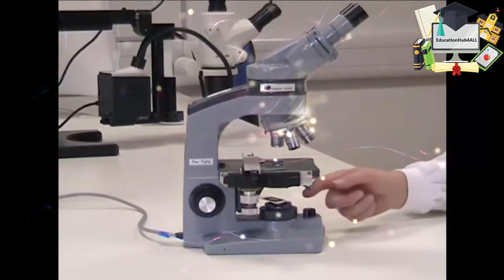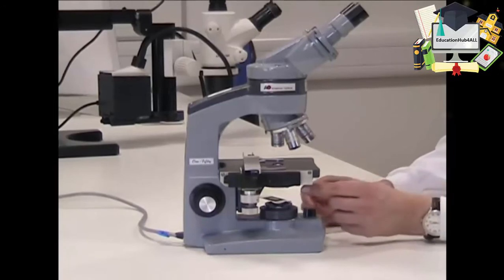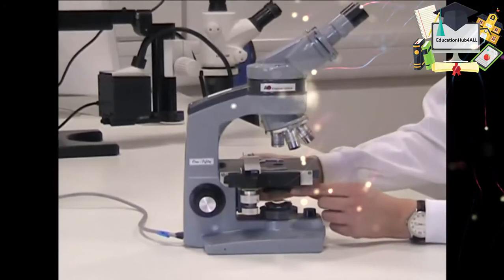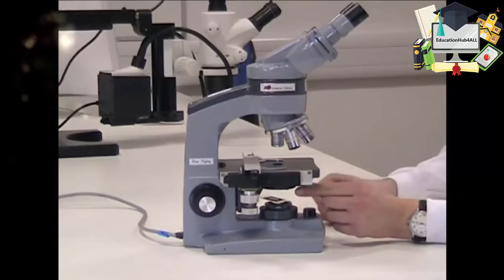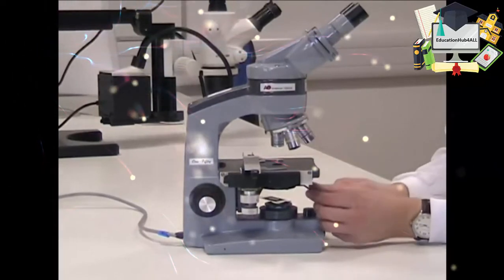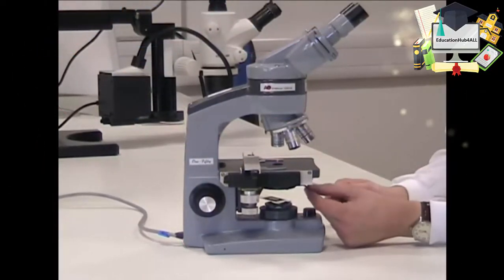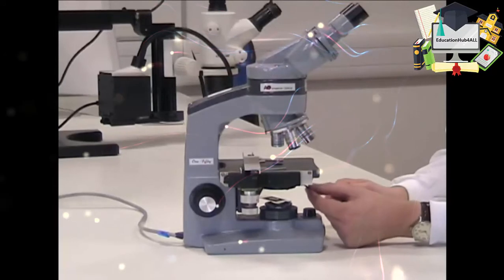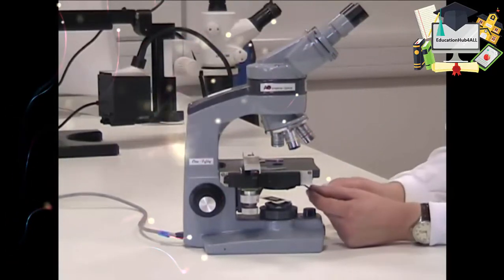The light is focused on the slide from below by this condenser lens here. Within the condenser lens system is this iris diaphragm which is adjusted by the lever at the front. This achieves something very important.